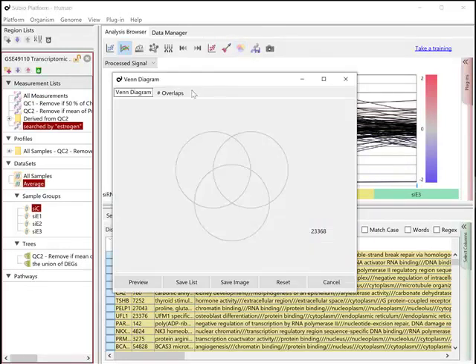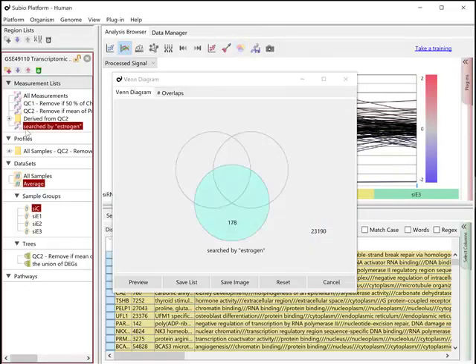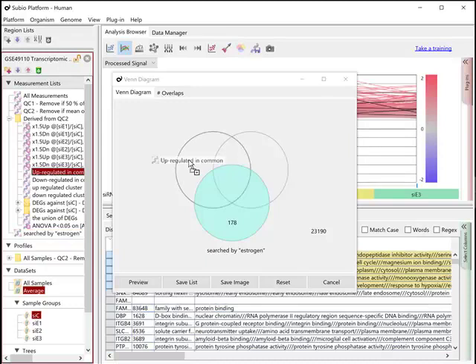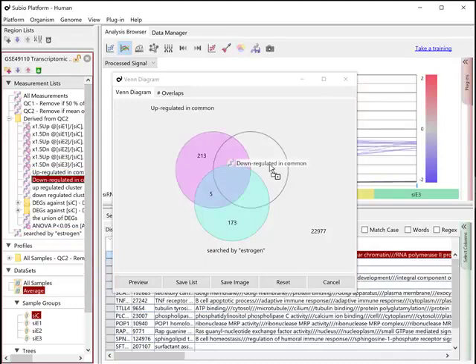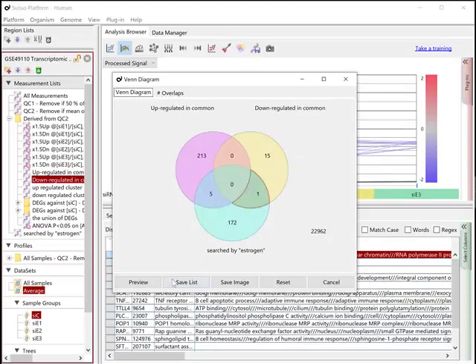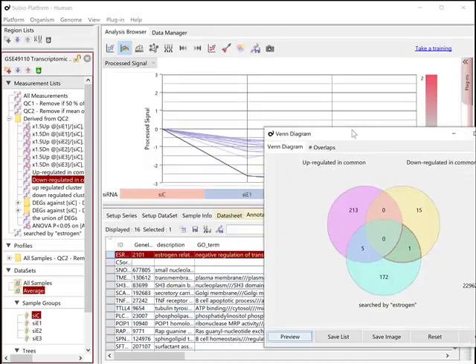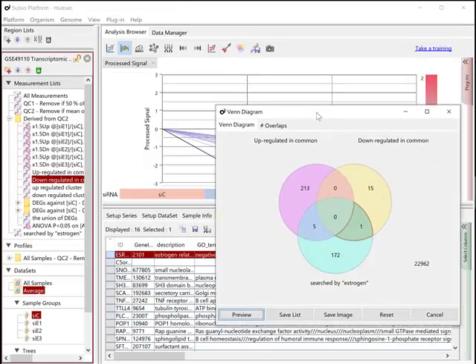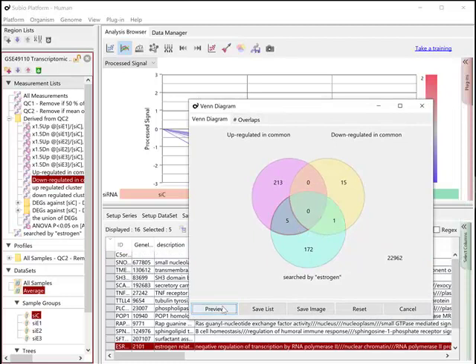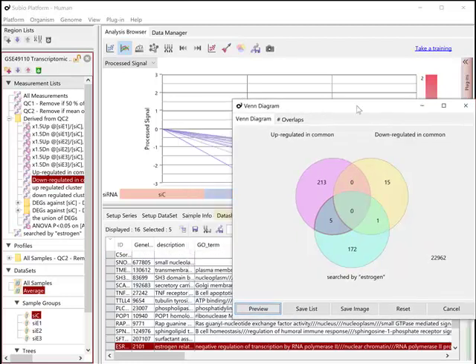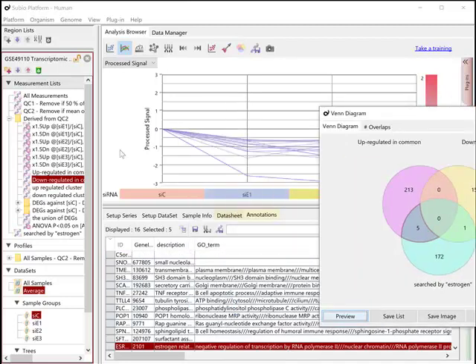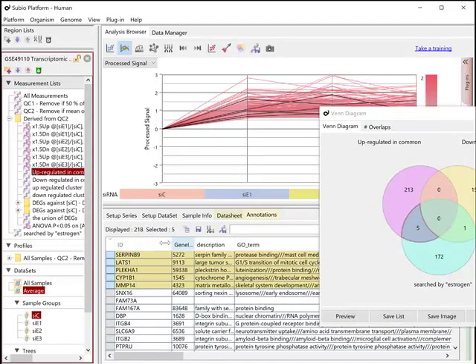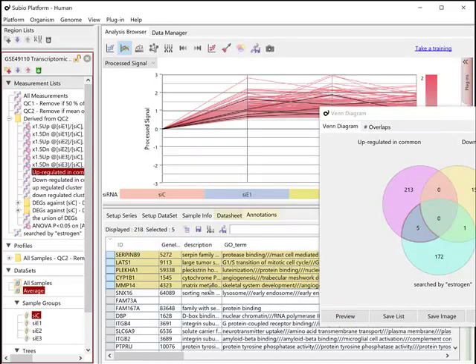Open the Venn Diagram tool to compare the estrogen-related genes and the commonly up or down lists. ESRRA is only one gene that is in the intersection of estrogen-related and commonly down lists. On the other hand, there are five genes in the intersection of estrogen-related and commonly up lists.